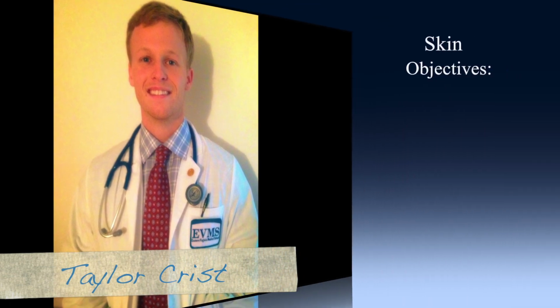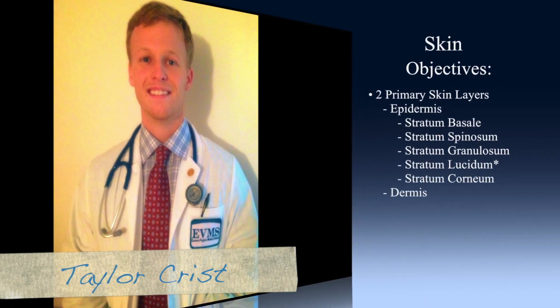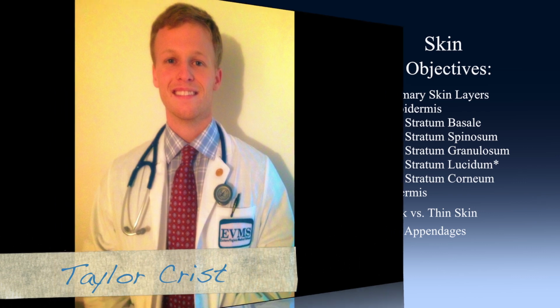In today's episode, we're going to be taking a more in-depth look at the skin. And by the end of today's lab, make sure you're able to identify the two primary skin layers and their respective constituents, tell the differences and similarities between thick and thin skin, and recognize some skin appendages that we will be identifying during this lab today.